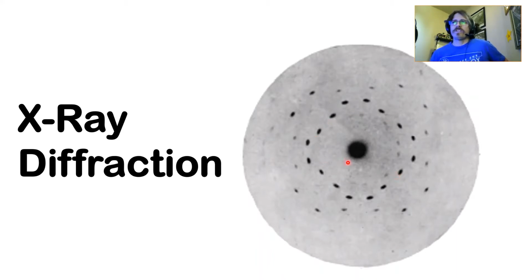But I wanted to throw this out here just to show you that the earlier forms of X-ray diffraction were exclusively pattern-based. Our society didn't have the technology to create a spectra from an incoming photon beam, basically.